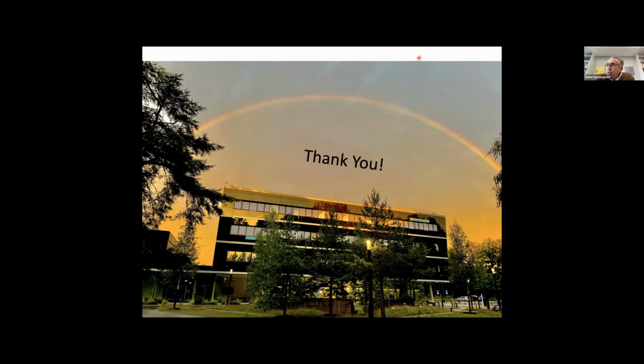Right. It's true that confocal microscopy is quite often limited by the speed of the scanners, because it's a mechanical scanning. At the end of the day, you have to scan your beam, and it cannot be done as fast as we can run a camera.